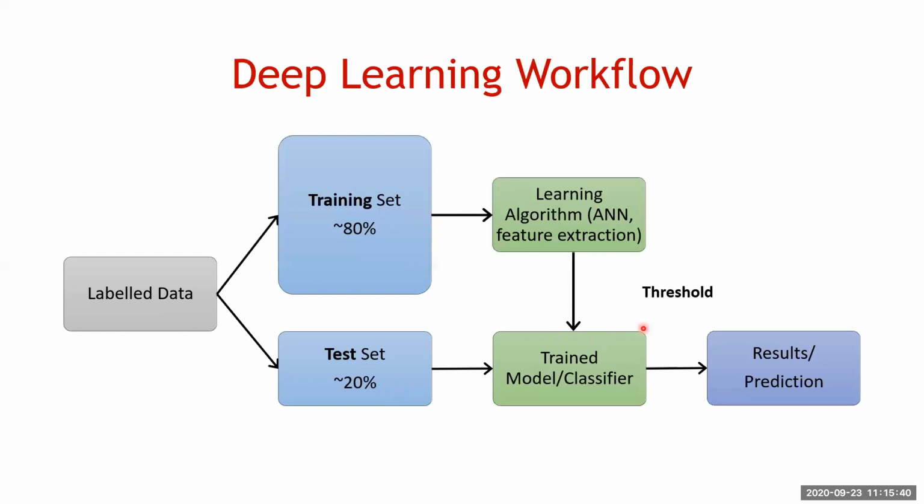And you will hear the term epoch, E-P-O-C-H, which refers to one full training cycle on the entire data set. You'll hear that because that's how you build a model. You go through many, many epochs. That's one of the parameter spaces that you have to set to build your deep learning network.